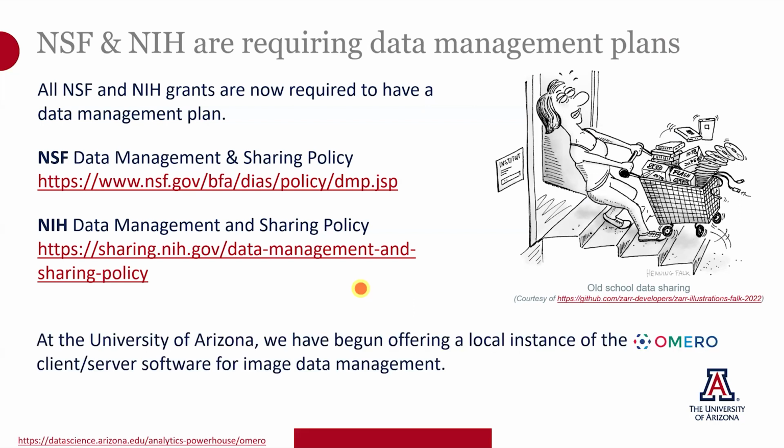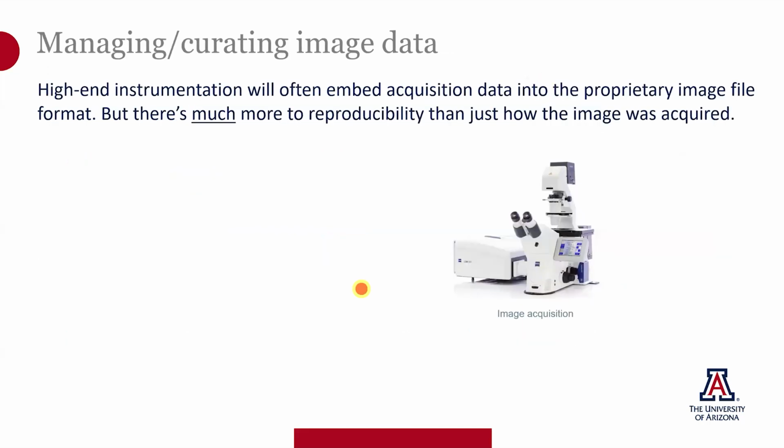So the U of A has begun offering a local instance of Omero, which is client-server software for image data management. We'll talk more about that as we go along. Now, for managing and curating information, the high-end instrumentation that you'll often find in a core facility will capture things about laser powers and filters and exposure times and those sort of things, magnification. But there's a lot more to reproducibility than just how the images were captured.